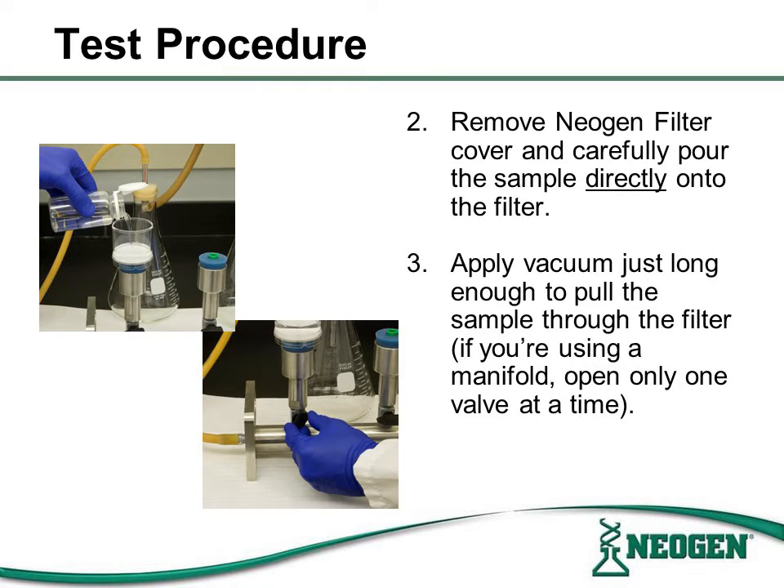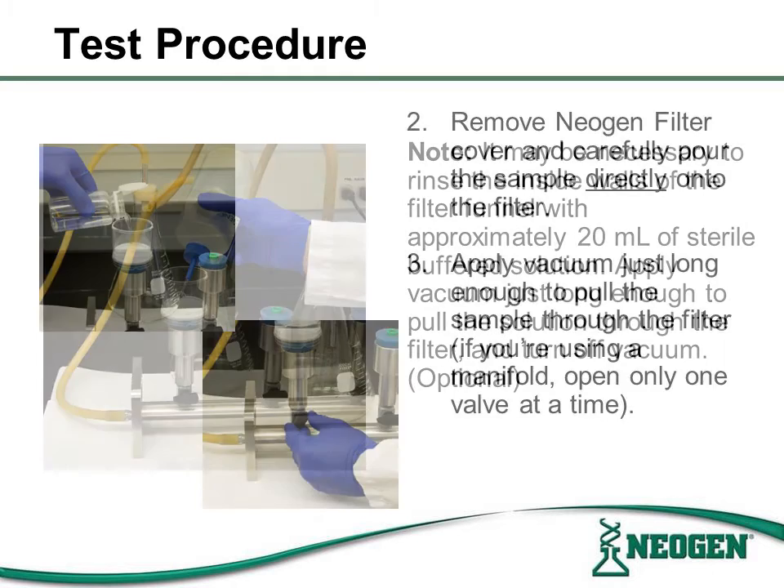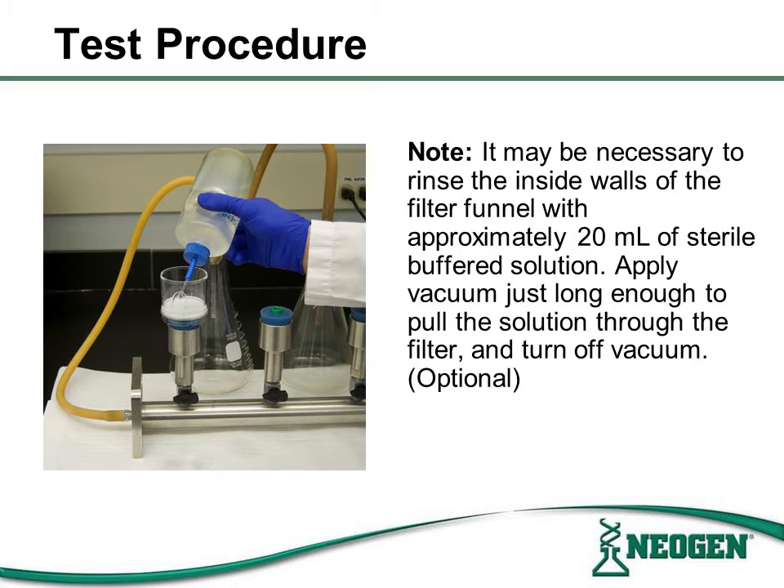Remove the filter cover from the Neogen filter apparatus and carefully pour the sample directly into the filter. When samples have been poured into all filter monitors, apply a vacuum one valve at a time and long enough to pull the sample through the filter. After applying the vacuum to a filter apparatus, it may be necessary to rinse the inside walls of the apparatus. Use about 20 milliliters of sterile buffered solution to rinse the inside walls and apply vacuum just long enough to pull the remaining solution through the filter.